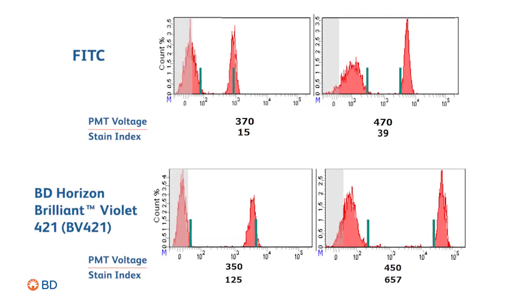How you set the gains — that is, PMT voltages on your instrument — can affect the stain index and therefore the resolution that you get from each fluorochrome. In these examples you can see the impact of increasing the PMT voltage for the PITSI and BV421 detectors by 100 volts. While the MFI of the negative cells is increased, the overall resolution as measured by the stain index has significantly improved by two and a half to five fold respectively.